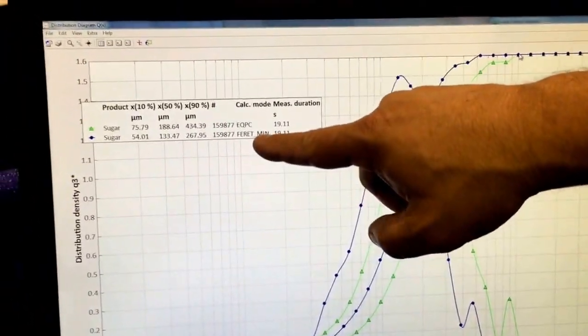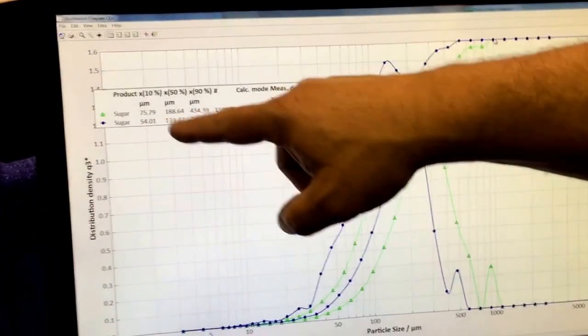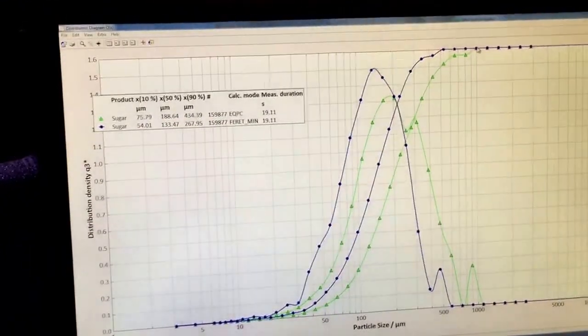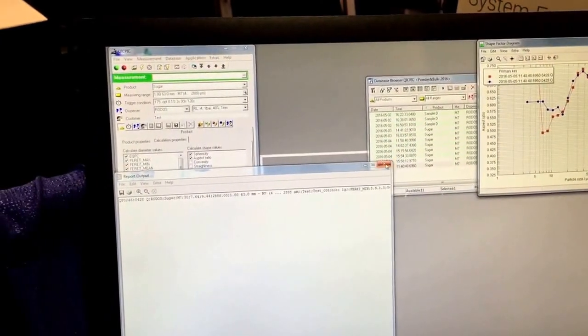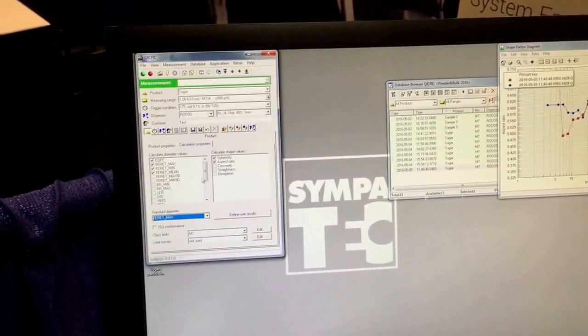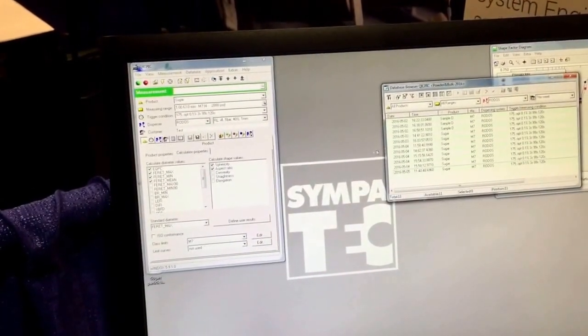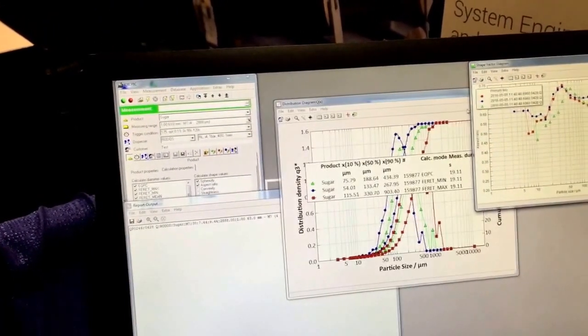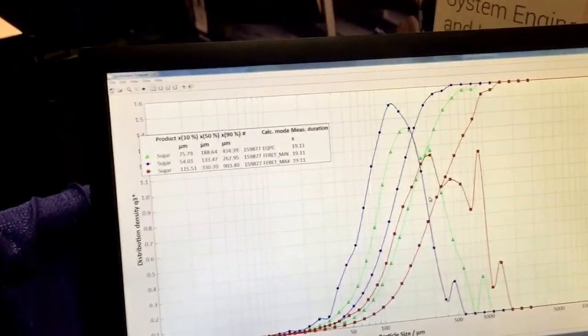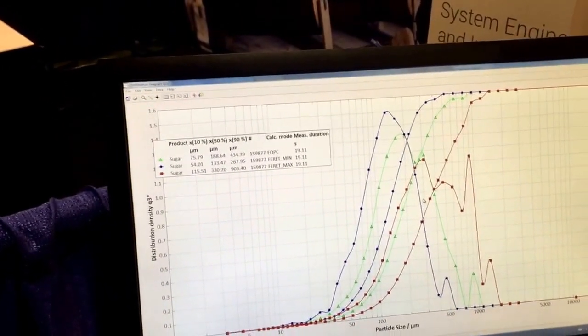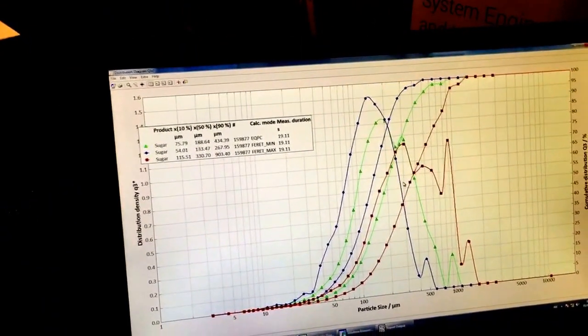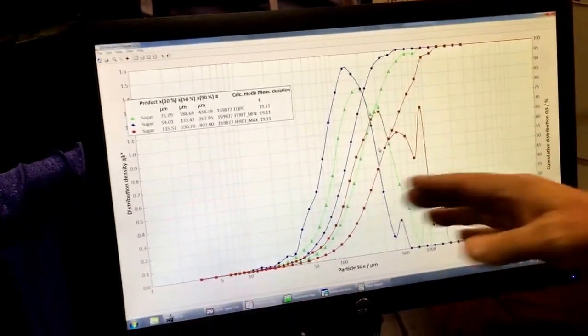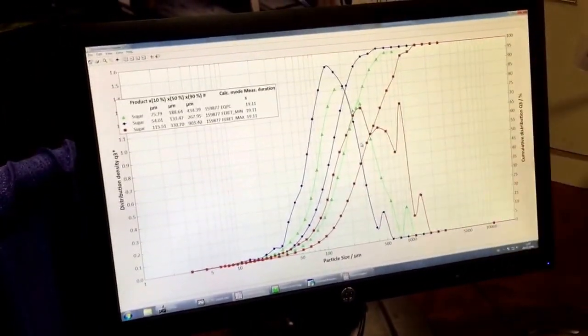So now it's giving me the minimum diameter distribution. I'm looking at the 10th, the median, and the 90th percentiles. And then if I want to know what the maximum diameters are, I can look at the maximum diameter distribution. Now it shows me the maximum diameter distribution of all the particles that I measured, the 160,000 of them.